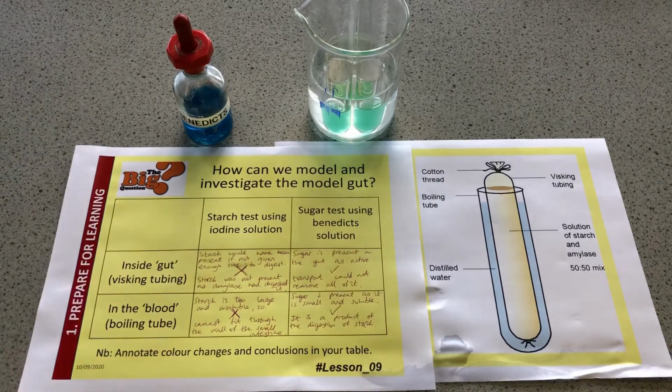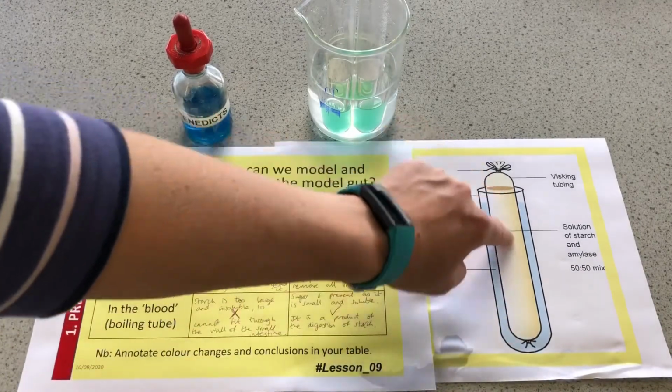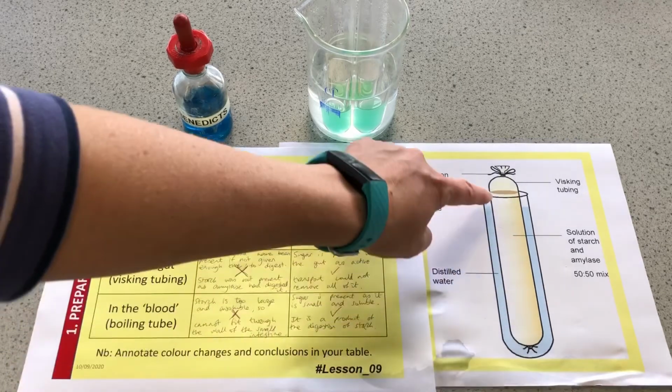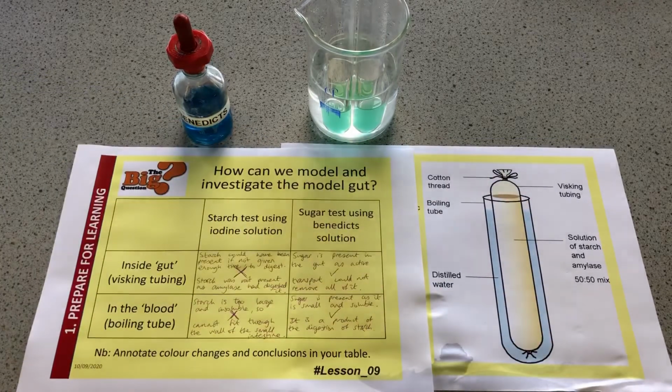Okay, so let's summarise. We had a model gut with the starch and amylase solution inside the Visking tubing, which represented the small intestine. We had water around the outside, which represented the blood. And we've tested, after leaving it for some time for the amylase to chop up the starch, for the presence of starch and the presence of sugar. We found no starch in the blood. It was too large, it was insoluble, so it could not fit through the wall of the small intestine. We found no starch inside the Visking tubing because it had all been digested, broken down by the amylase.